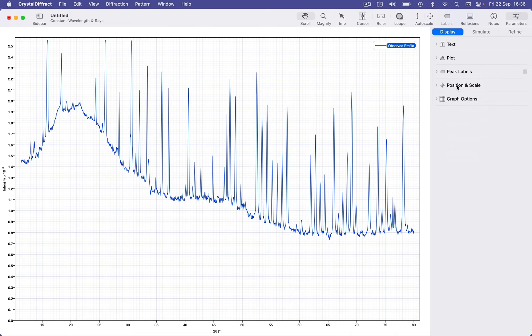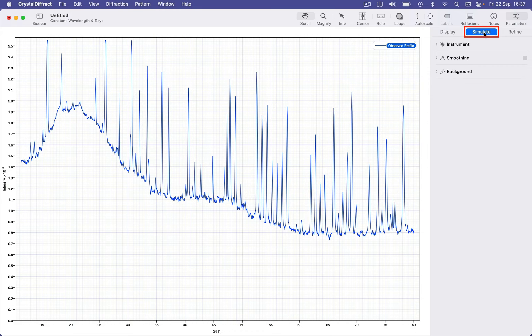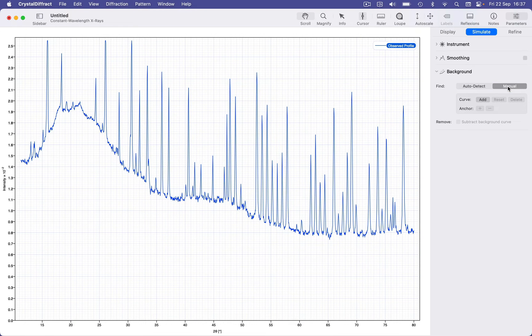If you have a noisy and uneven data set, such as this one corresponding to a scanned film, you can take advantage of automatic background detection and subtraction. To do this, ensure the pattern is selected in the patterns list, then navigate to the simulate inspector and open up the background group. We have two options: the easiest is auto, but there's also a manual option. Manual backgrounds require adding a series of control points to a Bezier curve, which can then be subtracted.